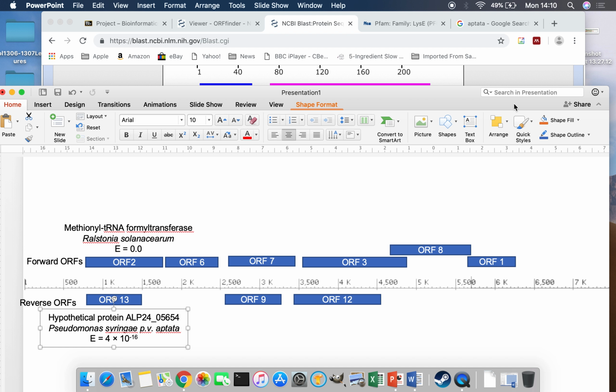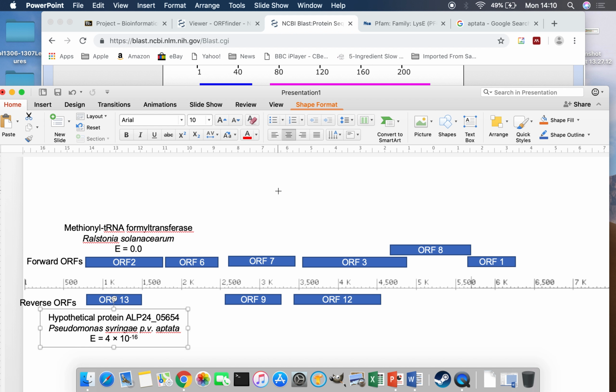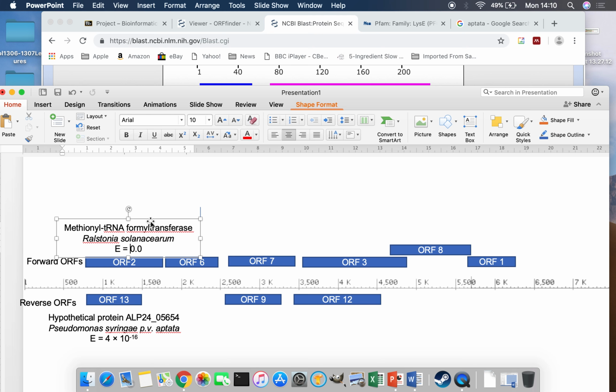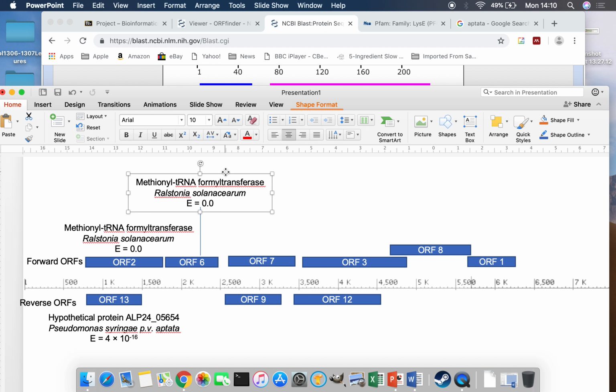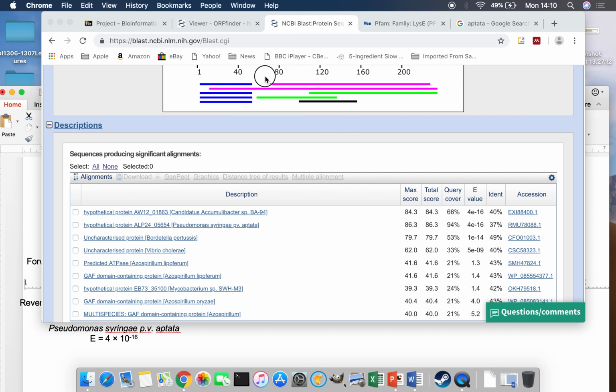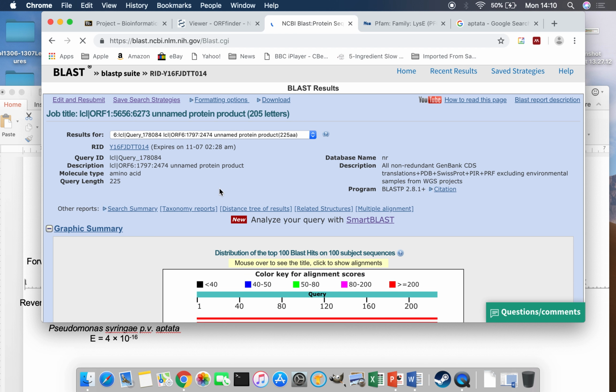And so for Open Reading Frame 6, we don't really have room to put it in there, so let's just put a little line in that says that it goes to there. And then we'll write what Open Reading Frame 6 is up above it. So there we go, etc. And this is basically what you're going to do. Let's do 6, and then we'll be done with this section. Or rather, I'll be done with this video.